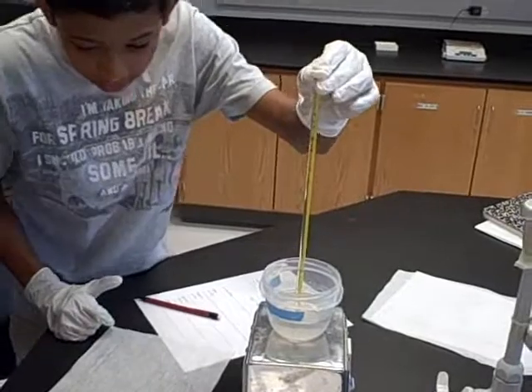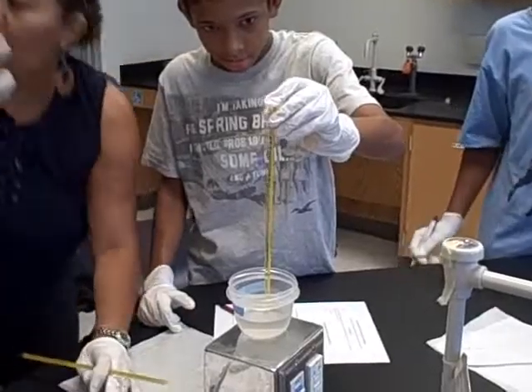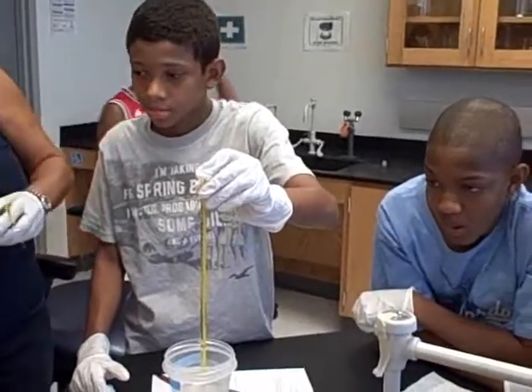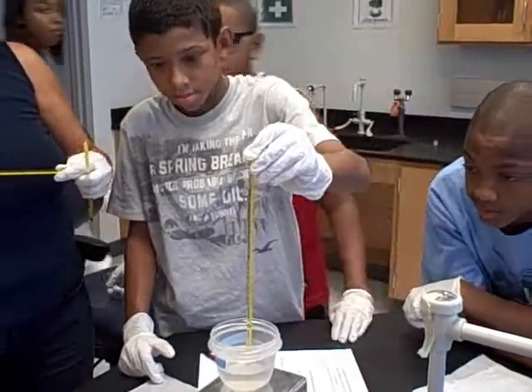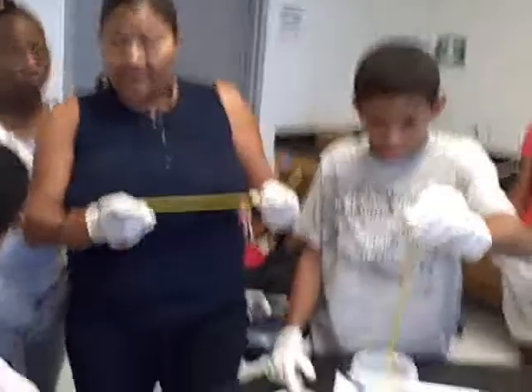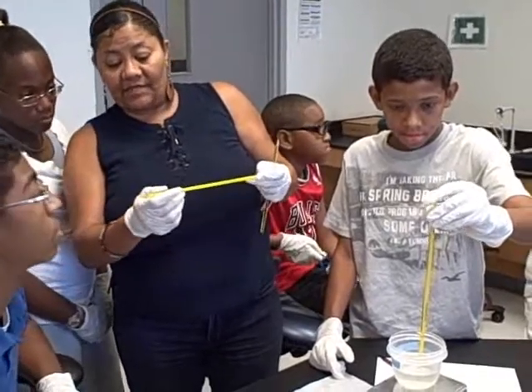Now, come here. I need everybody just for 30 seconds to come to this table. I have to show you something. This is a great example. Now, come on, y'all. Come around here. It goes to 100 right over here, and then it goes to 20. Right, sweetheart. Let me explain. That's why I have all of you here. This thermometer has two scales, and this one does not, depending on which one you have. But most of you all have two scales. You have what? Centigrade, which is Celsius, and Fahrenheit. On this side is your C value, your Celsius, and the other side is Fahrenheit.